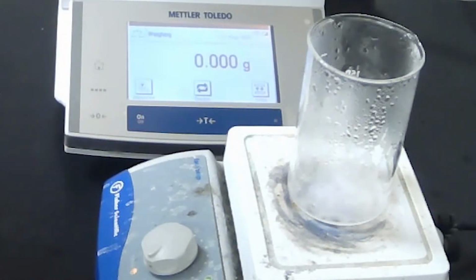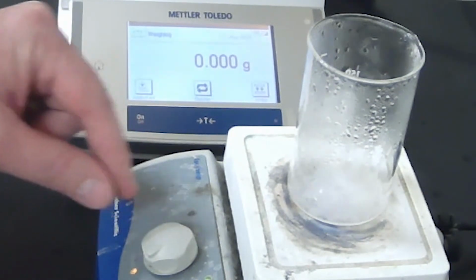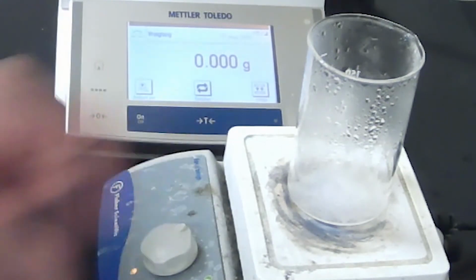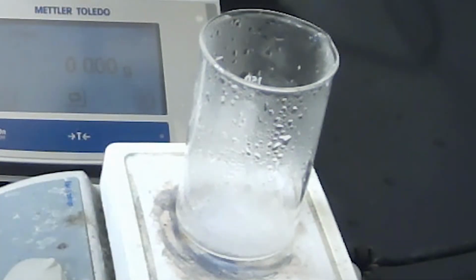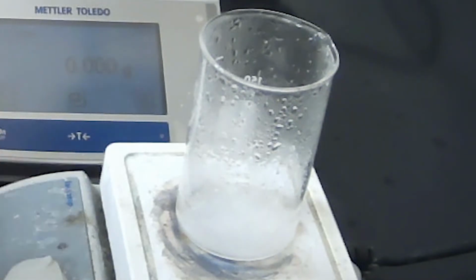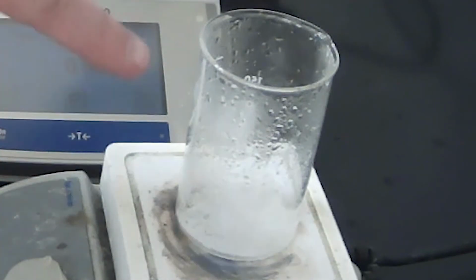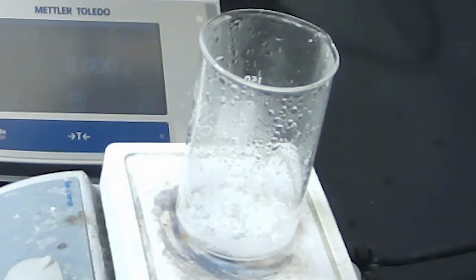Okay, you see the white foaming occurring? That's the beginning of the formation of the salt. There's not enough water to stay dissolved. We're going to turn this from high to a nice medium heat. And we see here, and we can hear the final popping. But we're not done evaporating because the bottom is mostly evaporated, but we still need to evaporate the sides. That'll take approximately 3 to 5 more minutes. And now we're getting a lovely popcorn effect.